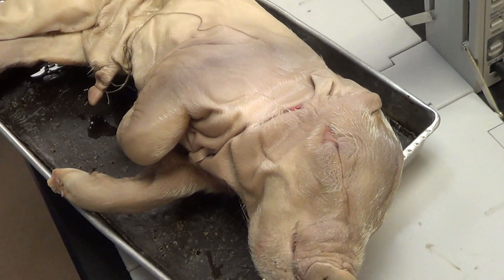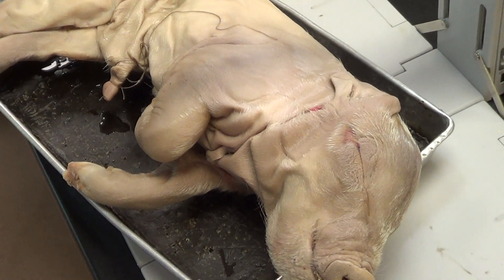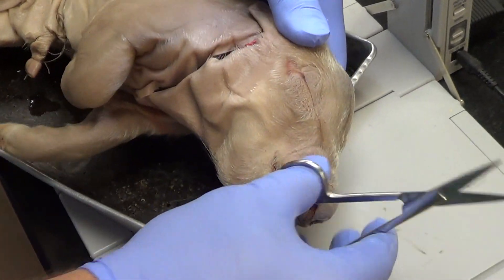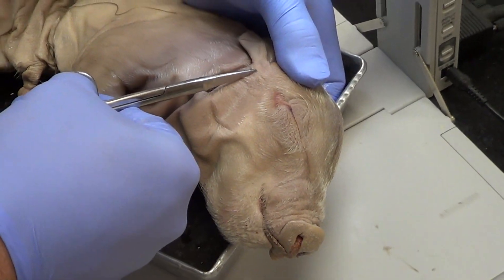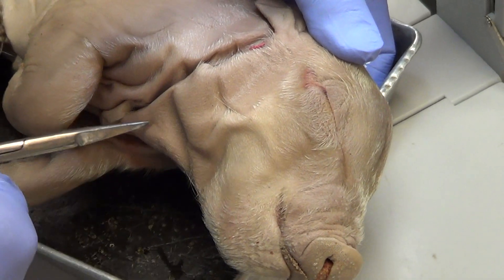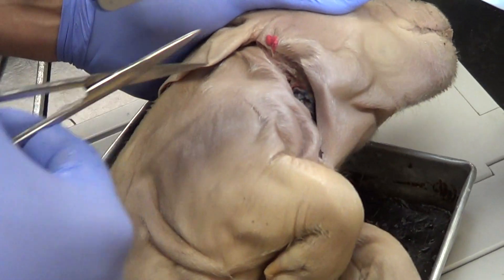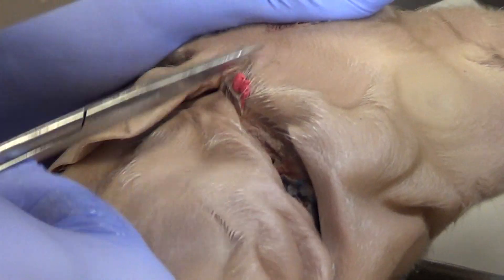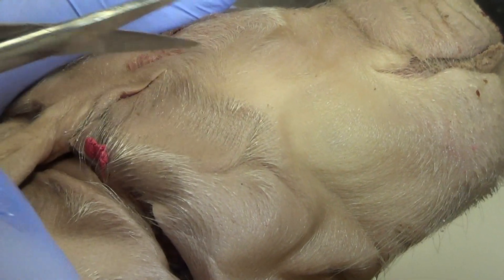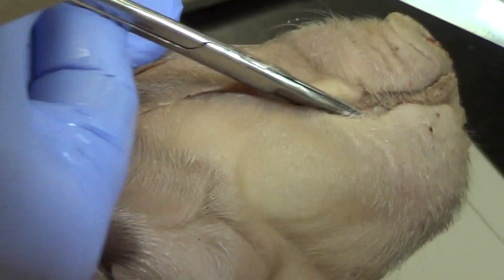Now this is where the technique comes into play. You need to pay attention to this. That will serve as one side of our triangle. The other side of the triangle will be a superficial cut underneath the eye to the corner of the mouth, then from the corner of the mouth down to the other side. I'll start that right now — put my scissors in and try to stay as superficial as possible. It helps if you have sharp scissors. I'm going right underneath the eye to the corner of the mouth.